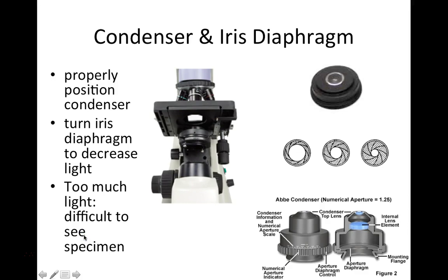The condenser and iris diaphragm are below the stage. When properly positioned, we are able to focus the cone of light coming from the illuminator in a perfect spot to illuminate our specimen. We always want to raise the condenser to its highest position just under the specimen. We decrease the light intensity with the iris diaphragm at the base of the condenser itself. The condenser iris diaphragm can be adjusted by turning a notched wheel clockwise or counterclockwise to open and close it.